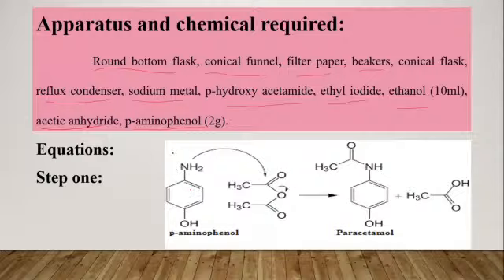The para-aminophenol is treated with anhydride, that is acetic anhydride. Then we will get acylation, that is paracetamol.